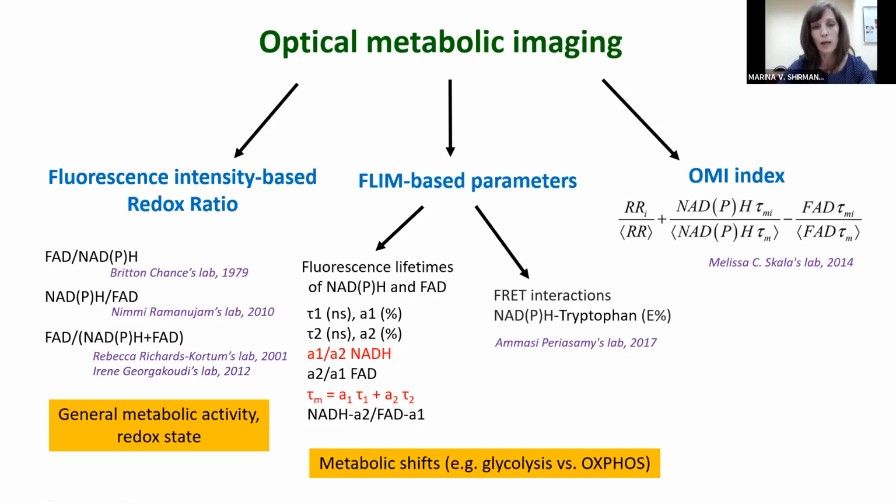But of course, these cofactors are involved in a number of processes. Some other metabolic pathways can also contribute. This is a slightly more complex, complicated story that I'm showing now. And a mixed approach developed by the group of Melissa Skala used a kind of combination of redox ratio and fluorescence lifetimes of NADH and FAD.